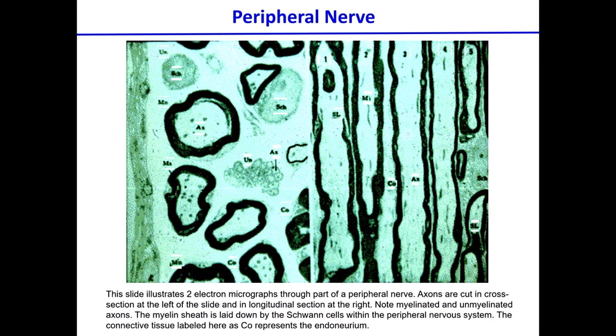Questions? Yes? This one, yes. Yes. The nucleus doesn't stain properly with this stain.